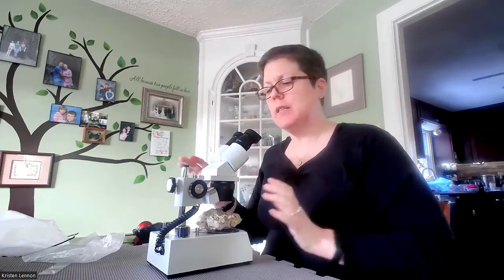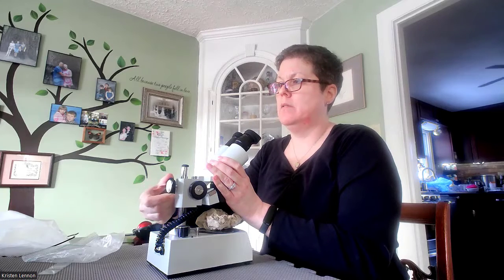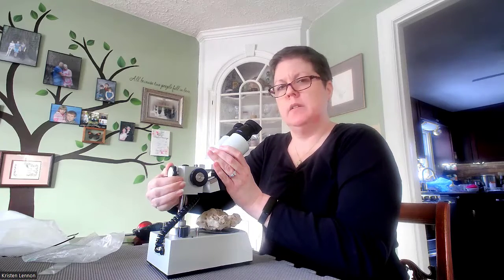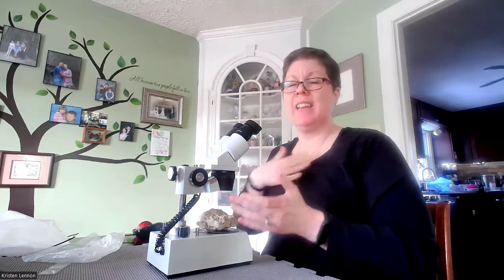So what we want to do in this case is support the head of the microscope with our non-dominant hand, loosen this, put the microscope all the way up to the top, and then tighten, finger tight, right? Not like crazy superhero tight, but not too wimpy either, so that it stays, because we wouldn't want this to crash down onto the rock. It'll destroy the microscope and then I'll cry.